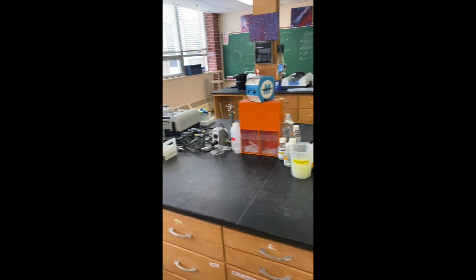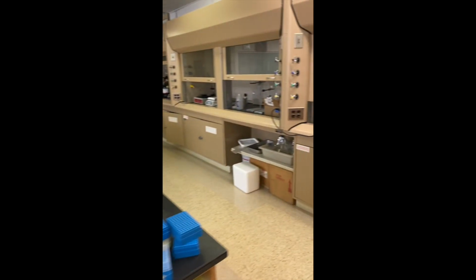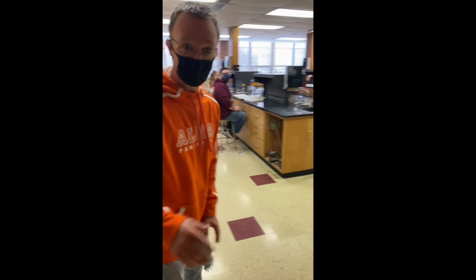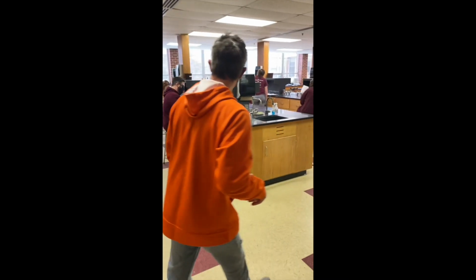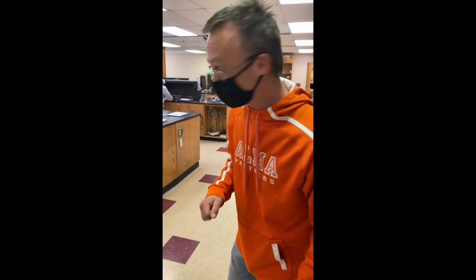So this is a great place, especially when it's filled up with students, but why don't we go try to find a place where there are students right now? Okay, this is our Chem 115 laboratory, so it's filled with freshmen, very first semester course. Well, I guess it's winter semester, so these are second semester freshmen, so come on inside. A lot of these students just came out of first year seminar, and this is their first science experience. They're almost all done with their chemistry, but we found someone over here. They're actually measuring the density of soda pop. How cool is that?